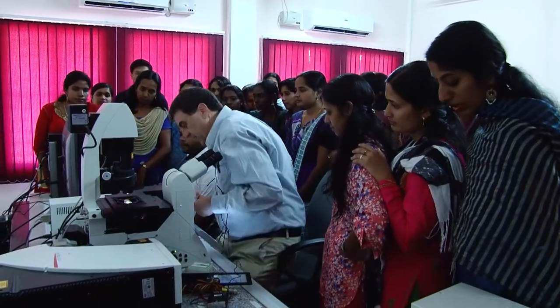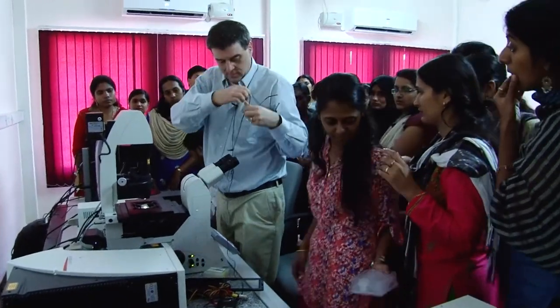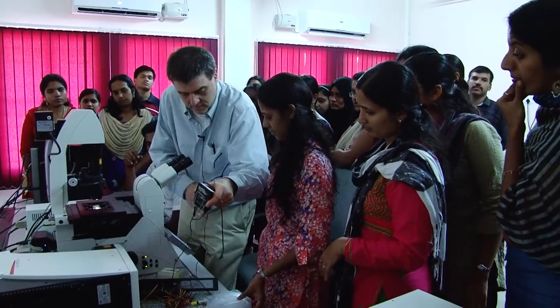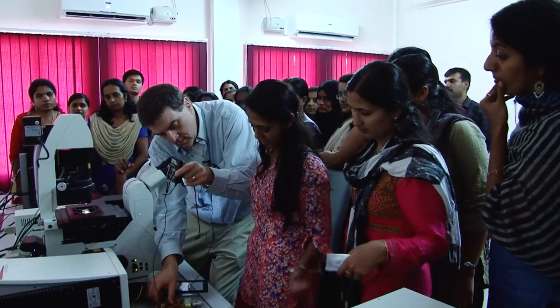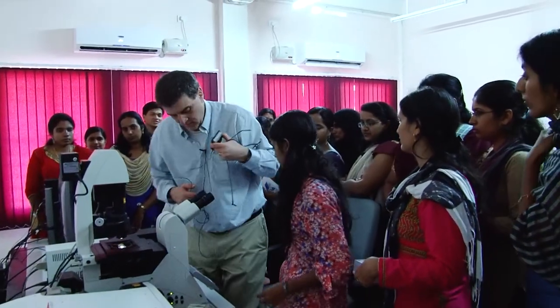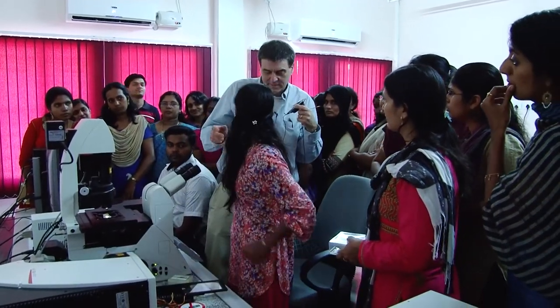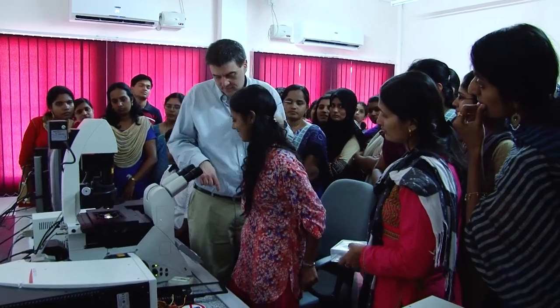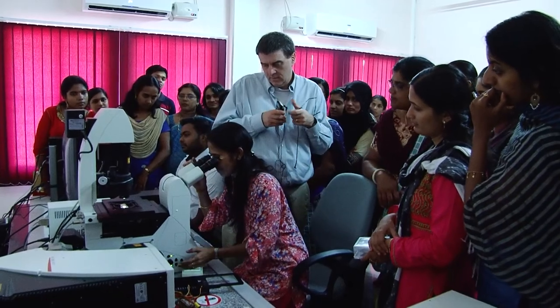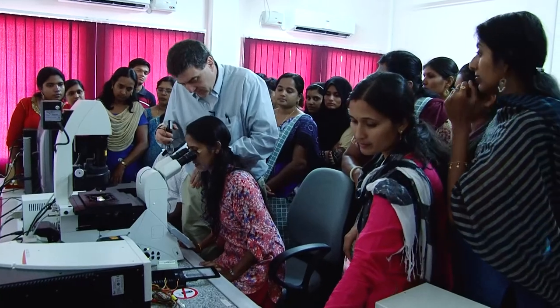Okay, so why doesn't somebody sit down here? Who wants to go first? Go ahead, sit. Get this out of your way. So go ahead, grab a seat. Now the one thing about when you're on a microscope, you want to be comfortable. We don't have time to keep adjusting the chair, but grab a seat. Okay, take a look in here. Is it too bright for your eyes? Or you can see it just fine.